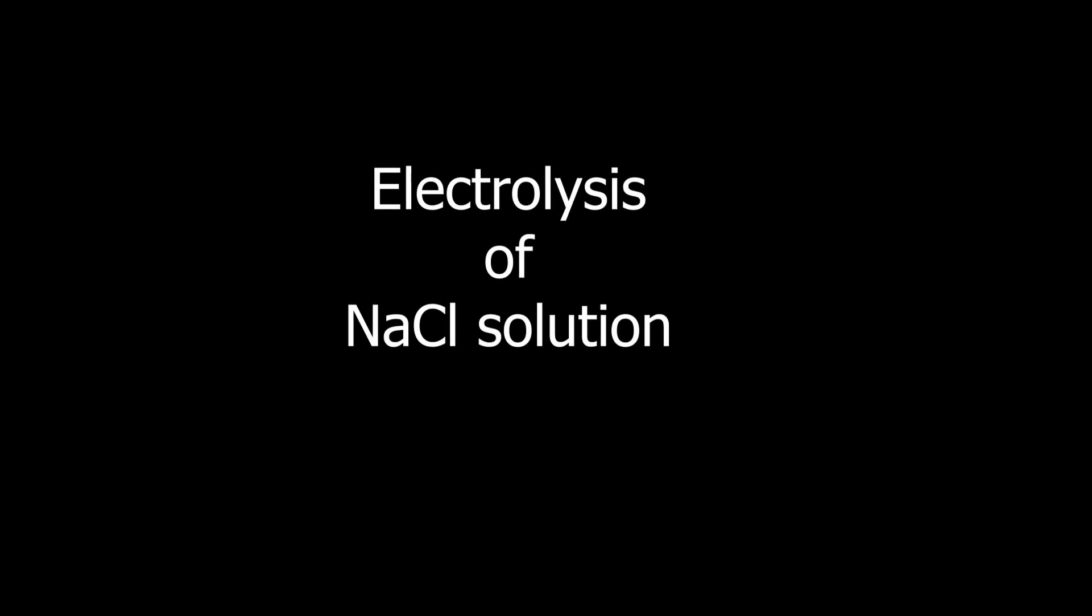Hello, welcome to Sergei's Chemistry. Today we are looking at electrolysis of sodium chloride water solution.